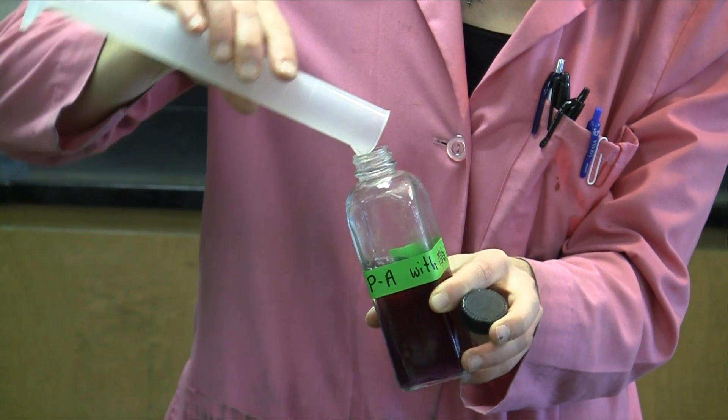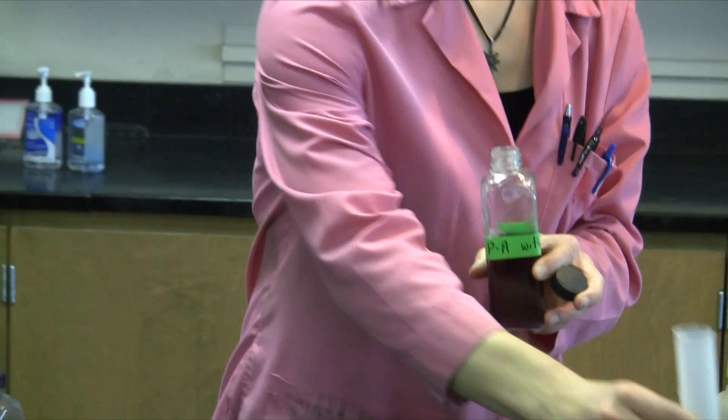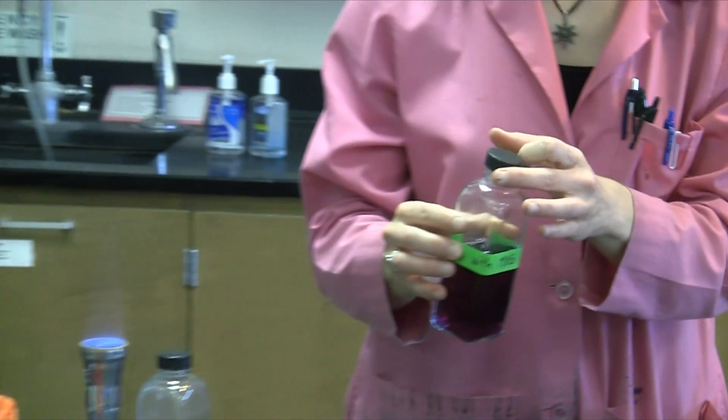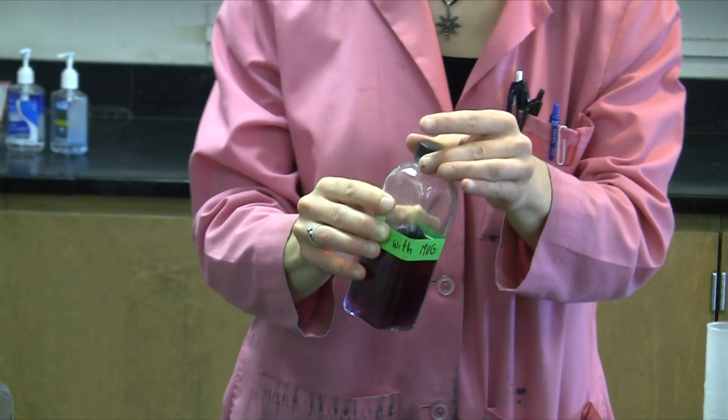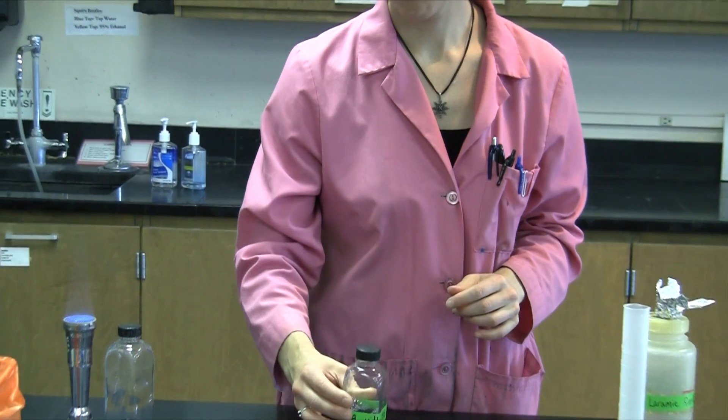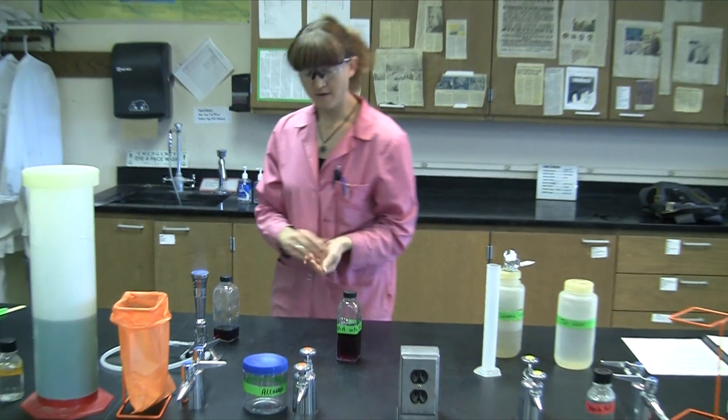Simply pour your water sample into the PA broth, and replacing the lid, give it a little bit of a mix. We'll then open the lid just enough to allow gases to escape, and we'll incubate this at 37 degrees for 24 to 48 hours.